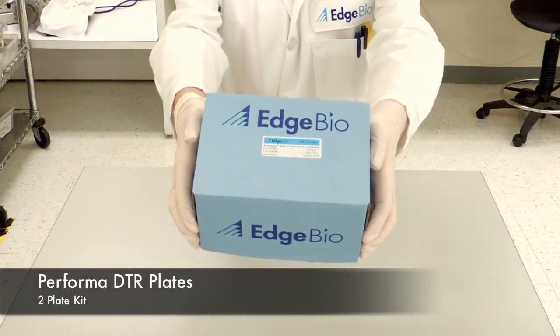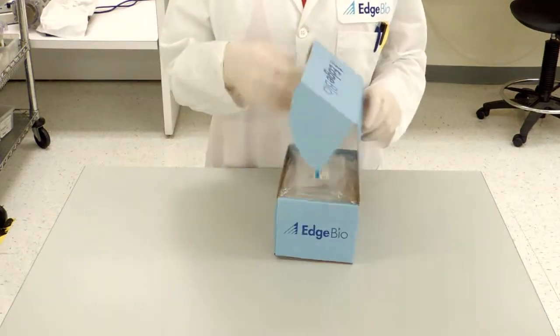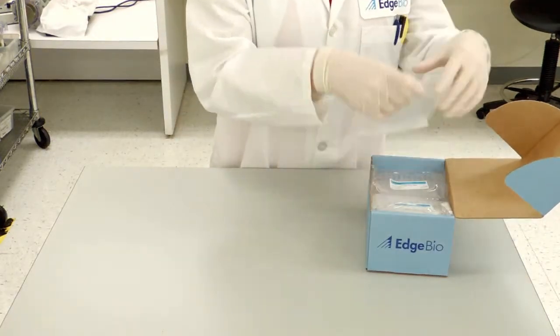Performa DTR plates come in a variety of kit sizes. For this tutorial, we will be featuring our two-plate kit.